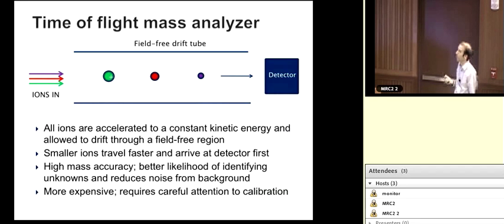Okay, another newer one that you may hear about is an Orbitrap mass analyzer. This was first introduced in 2005 by Thermo Fisher. Again, a lot of this stuff, if you ever get an occasion to buy a mass spec, you'll have to think about all of these different things. For us, we have certain instruments, and we choose the one that's most relevant.